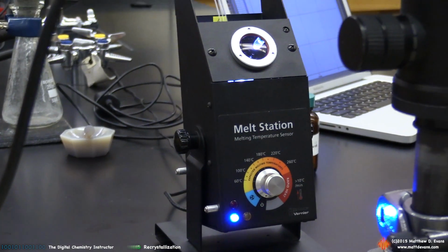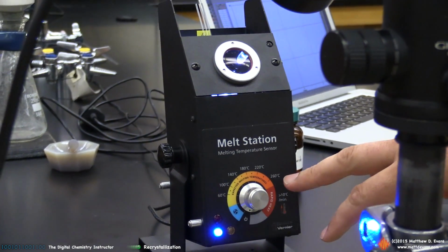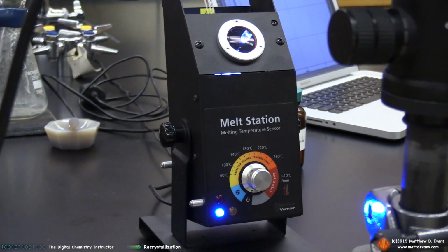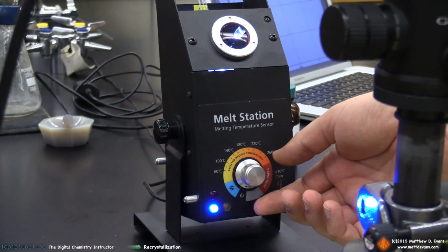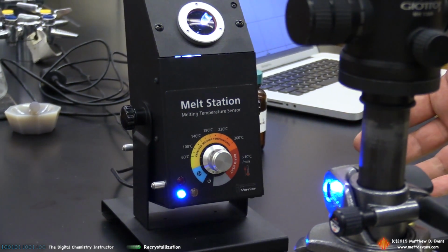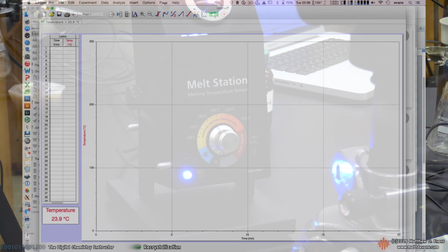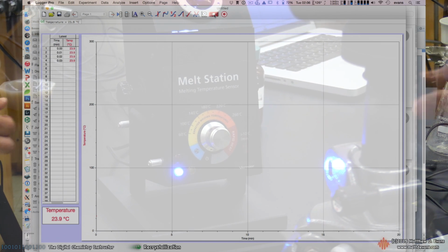I've got the melt station all set up and ready to go. I've loaded my capillaries into the top. Now there's a dial on the front of the melt station that, since I know the melting point temperature of my sulfanilamide is about 165 degrees Celsius, eventually I'm going to turn to about 165 to get this whole process going. Once I turn the knob, it's going to start heating up those samples, and meanwhile I'm monitoring the data with my computer here, and I'm going to press the start button, the collect button, and turn this dial up.